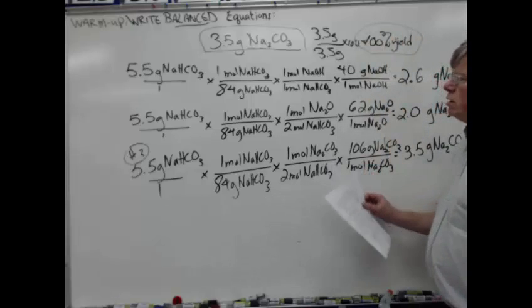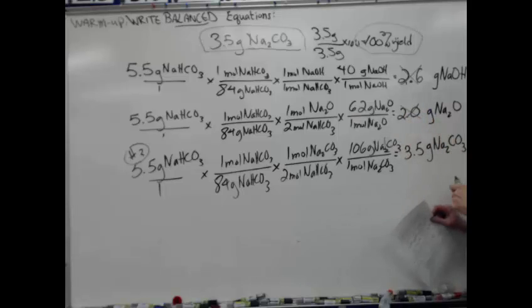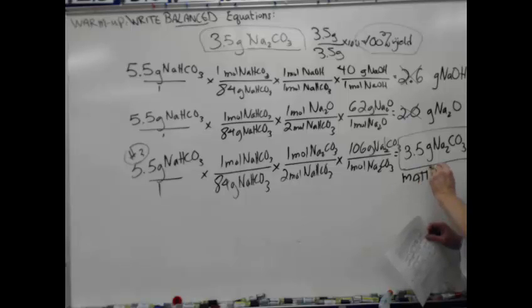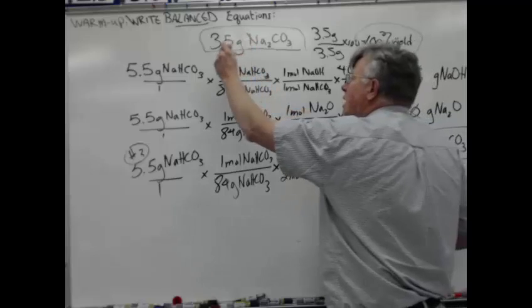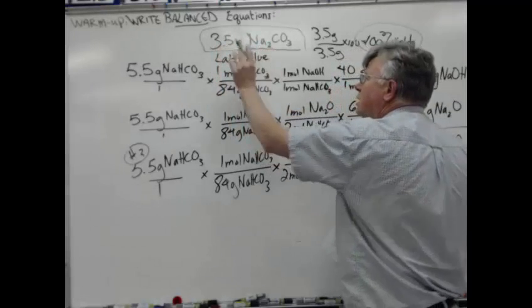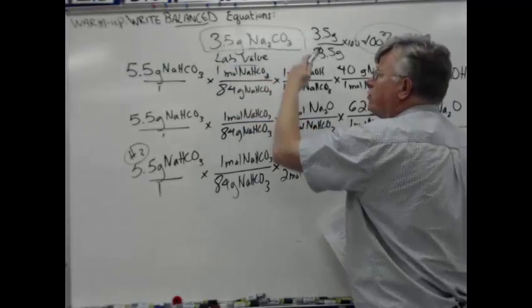So I got a very good result, and it just proves that, of course, these two reactions are not the true reaction, and the true reaction is this one, proven by the perfect match between the theoretical value, which is the value you get from just theory and math, against the lab value that I got from actually heating up the sodium hydrogen carbonate and getting a value for the product.